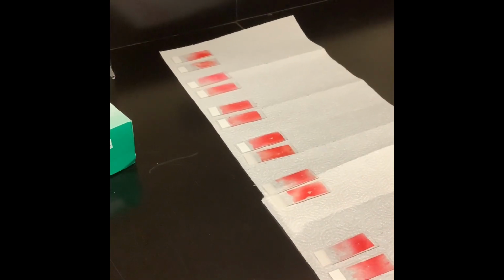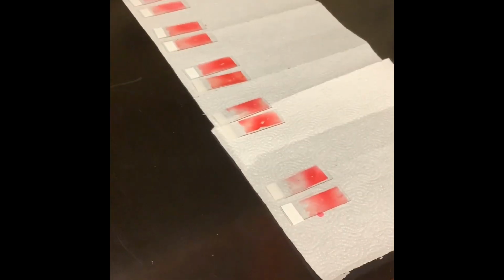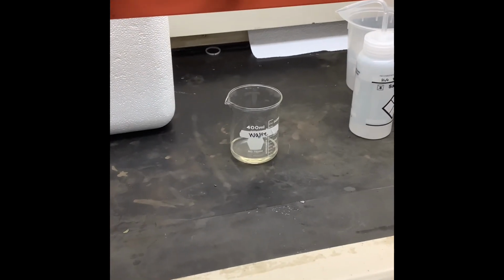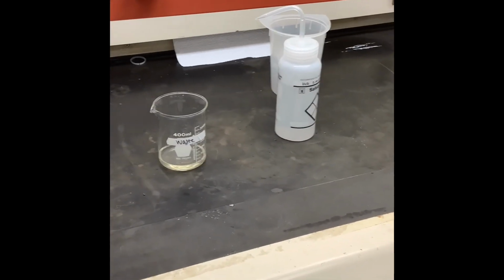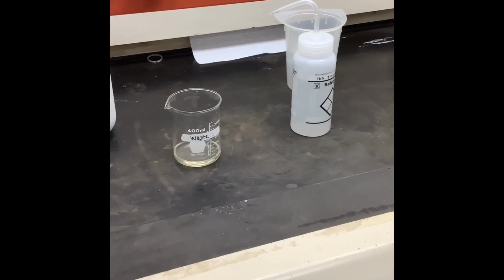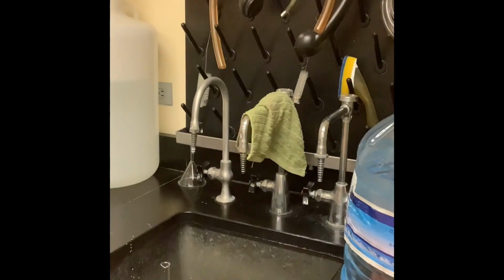So a few final remarks. Make sure that after you have all of your slides set up that you label them. And then over in the hood, make sure that both liquid and solid chemical waste go into the hazardous waste containers, and that all glassware is washed so that it's ready for the next round of acetolysis.